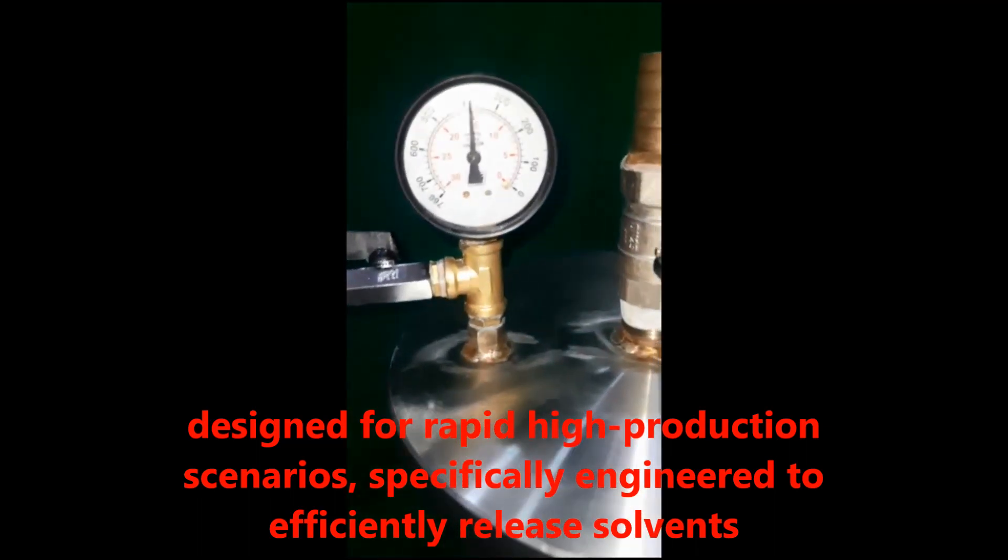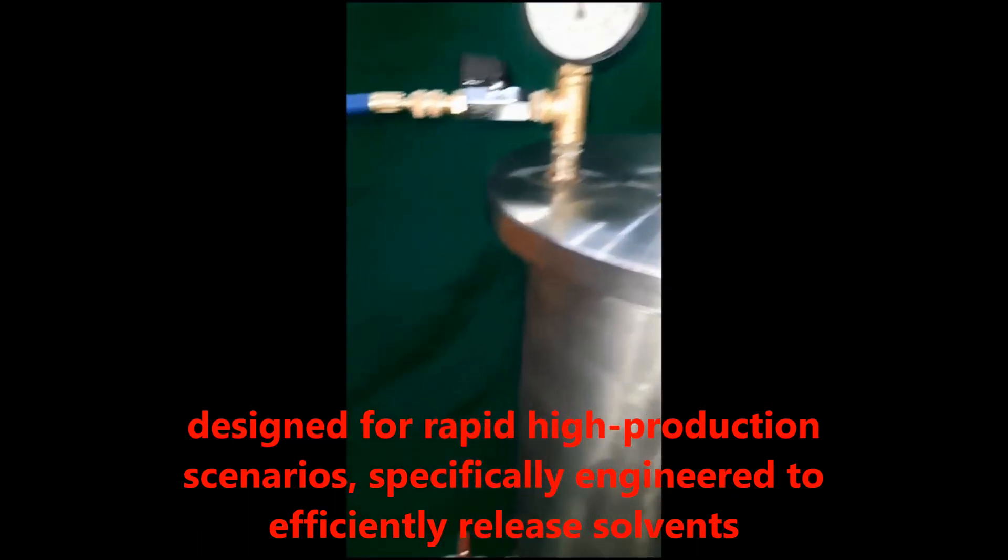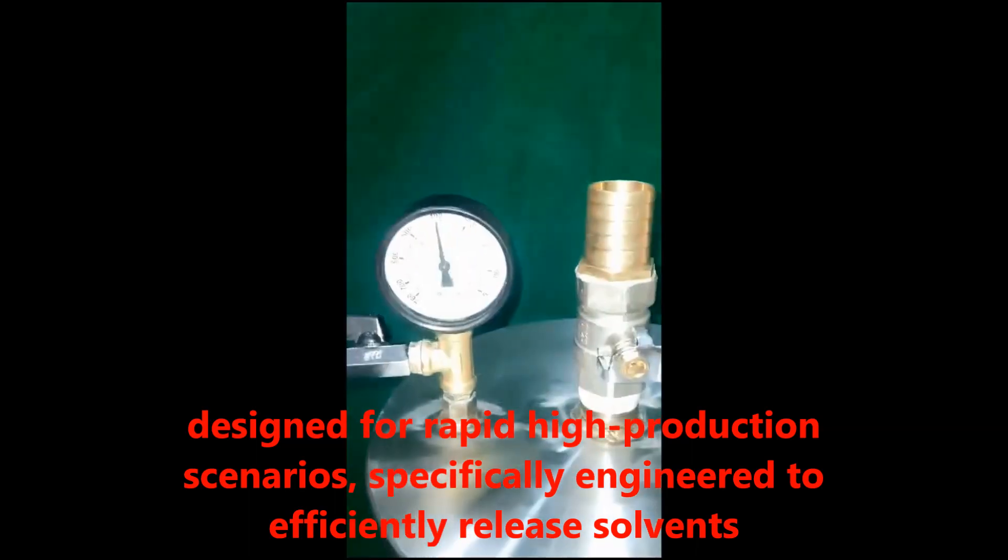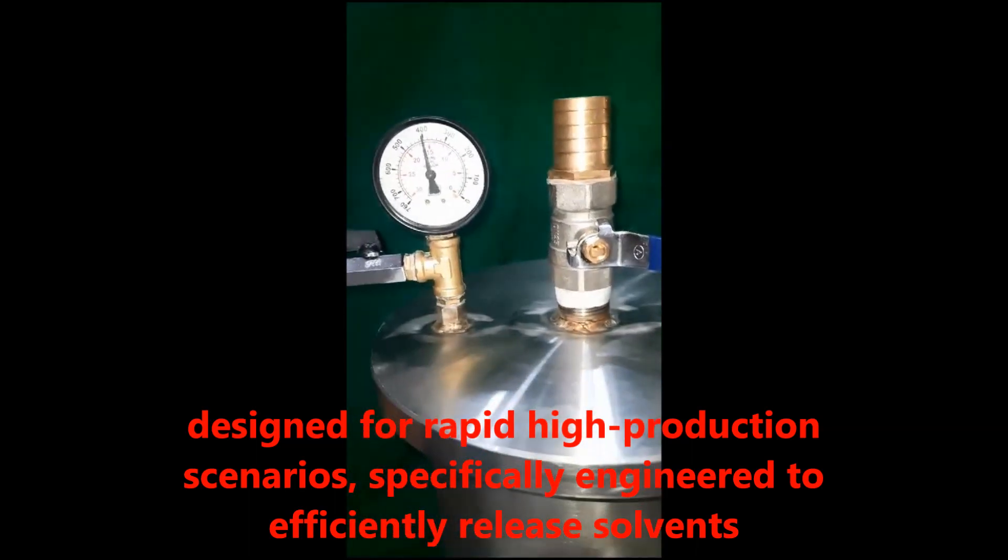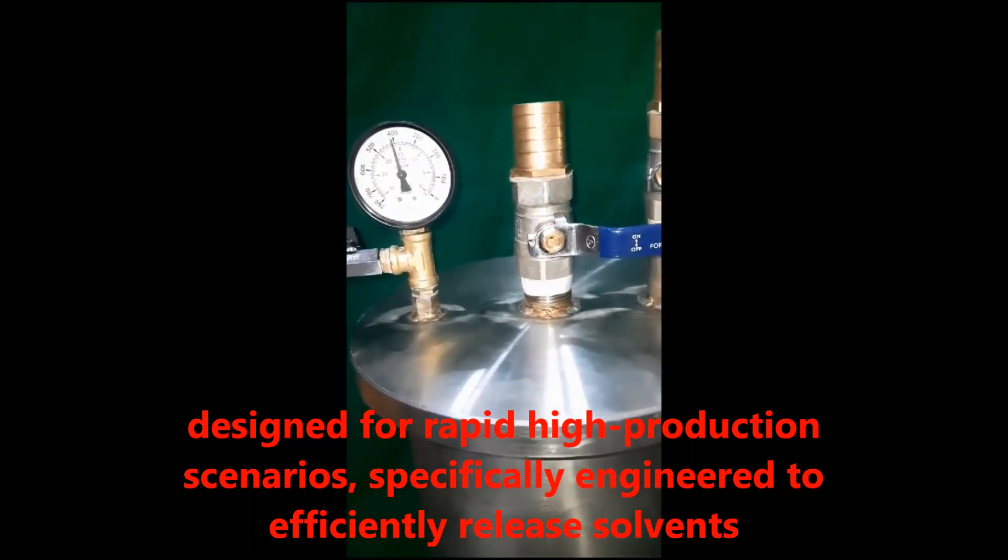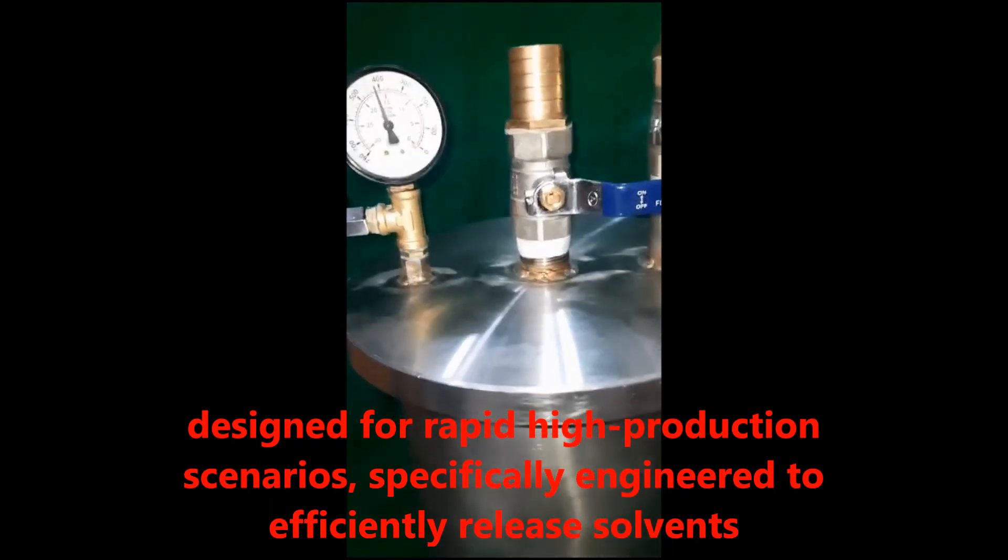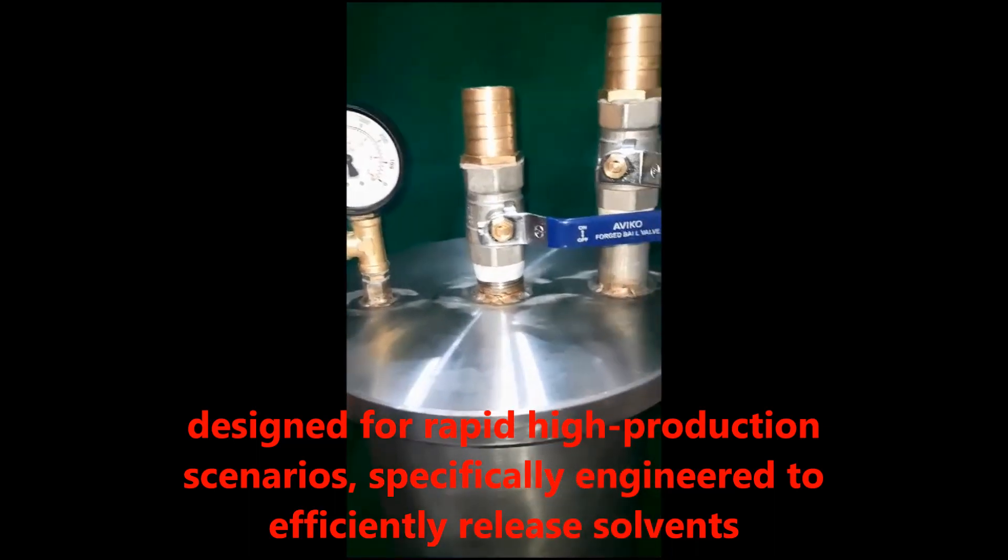This intricate arrangement ensures smooth flow and creates an expansive surface area, optimizing the capture of gases. The extended stainless steel tube in conjunction with the mesh network achieves remarkable coolness, providing an ample surface for preventing gases from entering the vacuum pump.